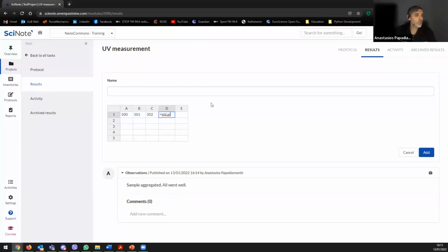You can use the Office online functionalities. Oh, come on. What's the command? Yes, got it. Sorry about that.